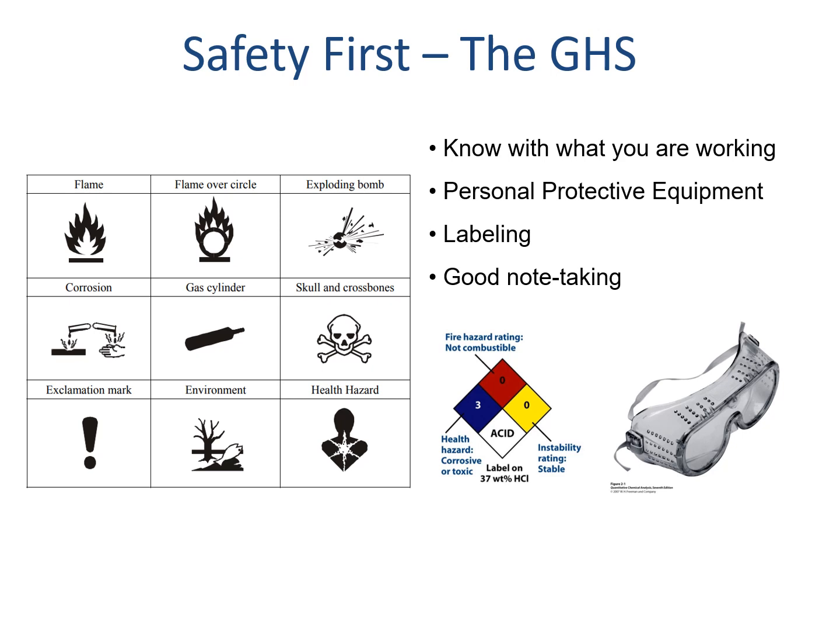This designates how we should deal with our waste. This symbol indicates that if we flush this down the drain, all the trees and all the fishes will die. As the fish die, they will also begin looking more like goldfish crackers than real fish, creating a secondary hazard. We don't want that, so we'll take proper care of our waste.